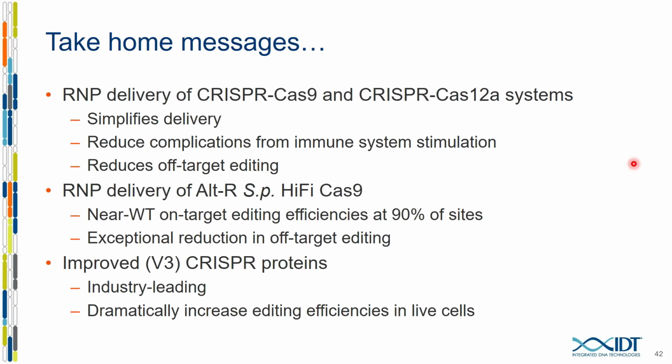But I think it's definitely a reasonable thing. In fact, every time in the laboratory we look at a new guide, typically we'll do a dose response going from high to low, looking at both on and off target. So I think it's a totally reasonable thing to add more and try and stress your system and find out where your particular guides and RNP complexes are toxic or not. Great.